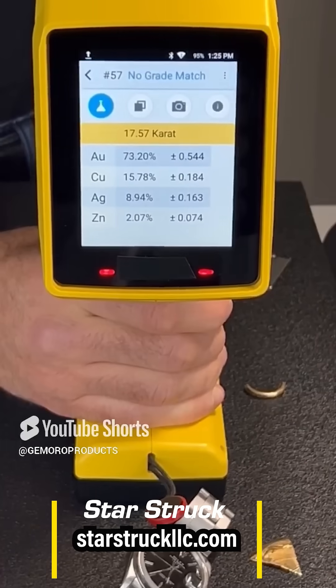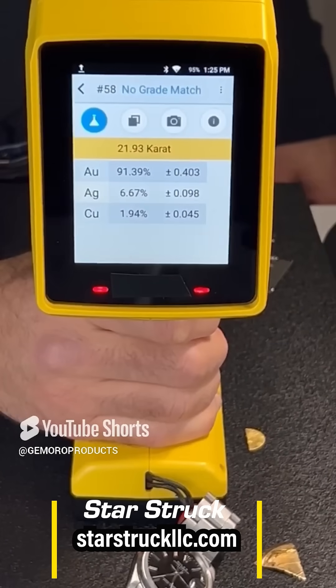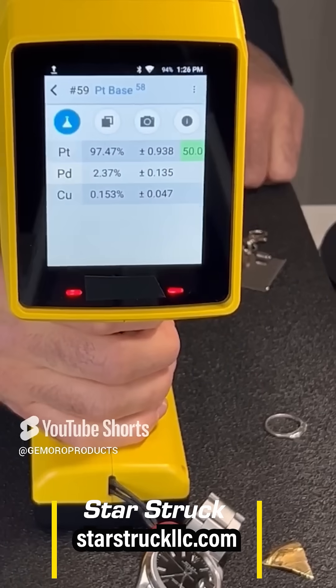Of course we had to put all those to the test. In this video we tested a fake Rolex, and sure enough the material came up 304 stainless steel instead of Rolex's authentic 904L. Totally cool.